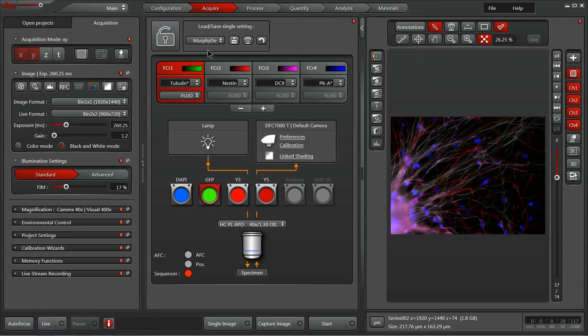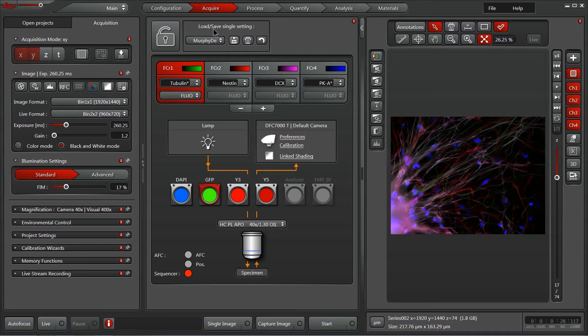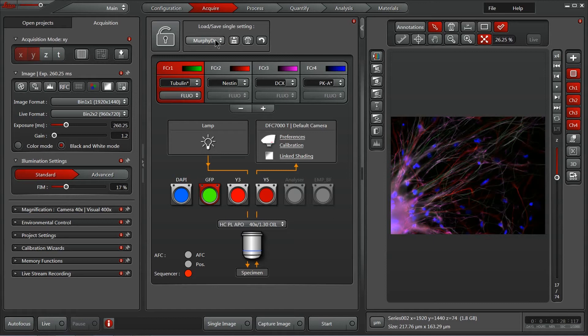Now let's have a look at the center panel here on the acquire tab. We've got the ability to quickly load and save settings right here. So if your experimentation is very consistent, I strongly recommend saving your settings and then just sitting down to the microscope and loading them each day, you'll be imaging in no time.